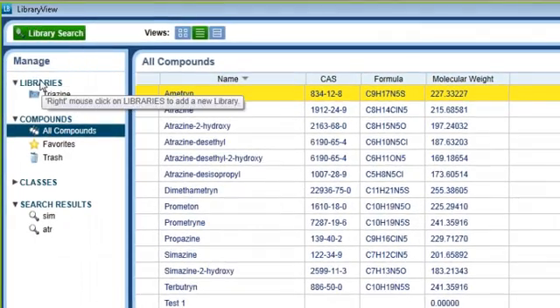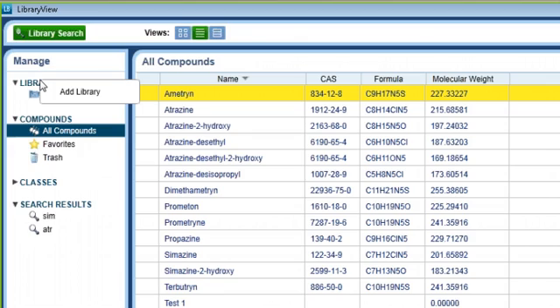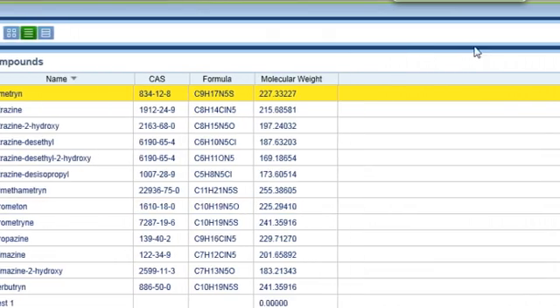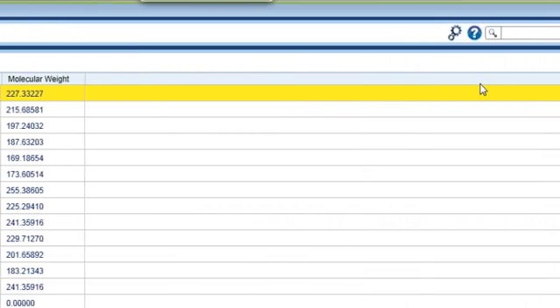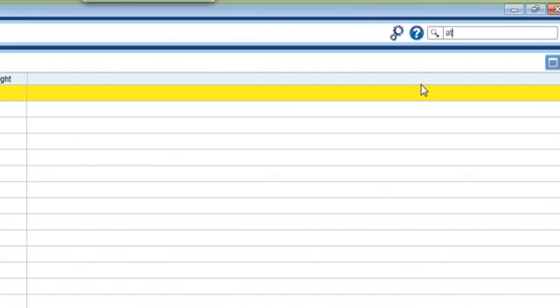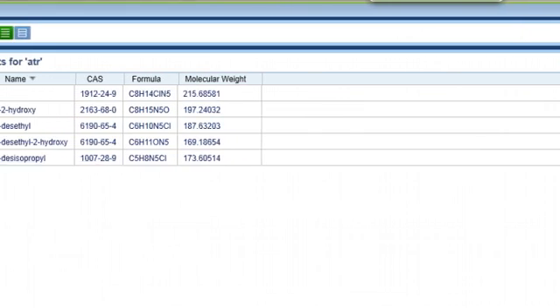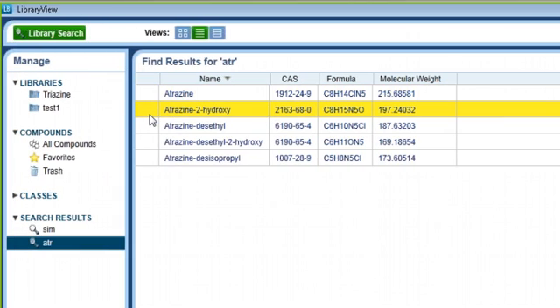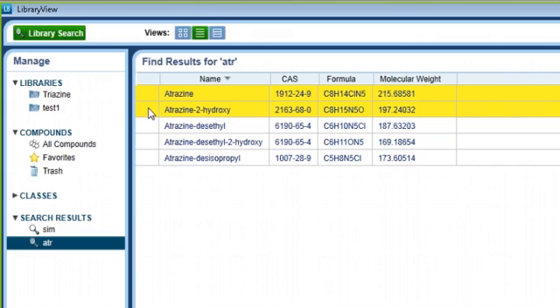If you look up in the upper left hand corner of LibraryView, you will see the libraries heading. If you right click on the libraries, you will be asked if you want to create a new library. Type in a name for your new library. You now have an empty library you can add compounds to. If you are looking for a specific compound, you can use the search box in the upper right hand corner. Type in the name or partial name of the compound you are looking for. You can then select the compound and drag it to the library. You can also highlight multiple compounds using the control key and drag them to the library.